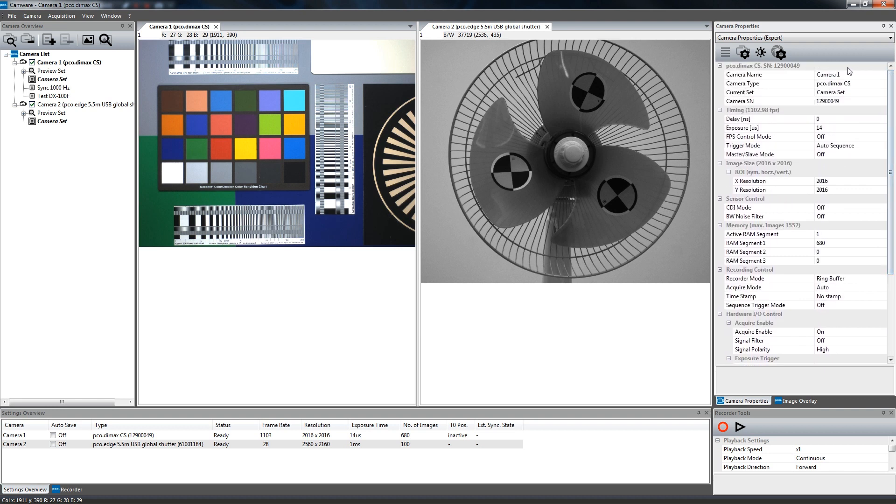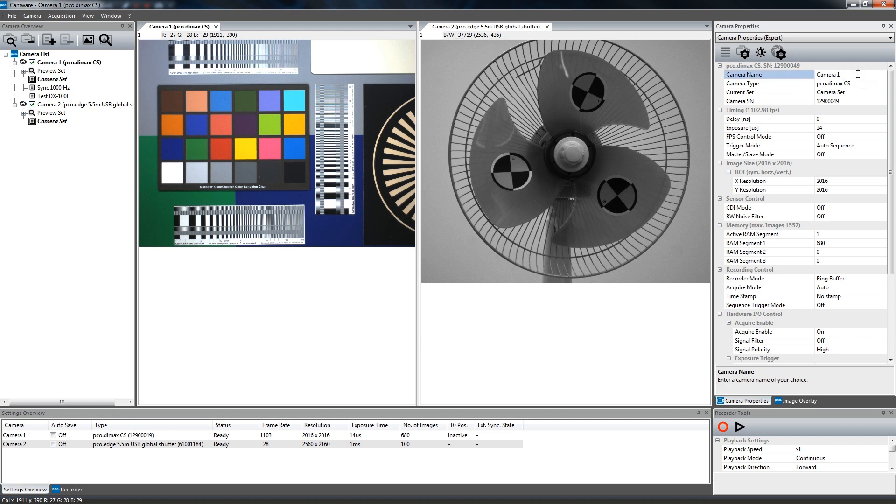Now let's have a closer look at the individual functions of the properties dialog. The first section is related to your camera model. Here, you can enter in a preferred camera name, which helps for orientation when working with multiple cameras.